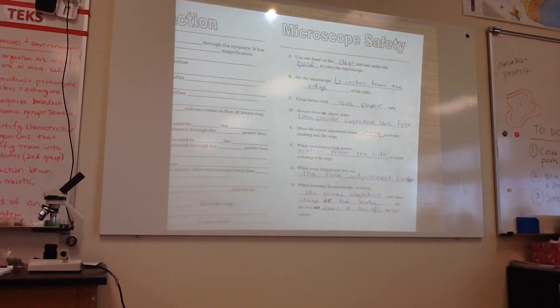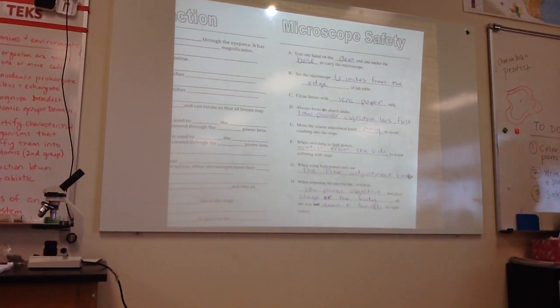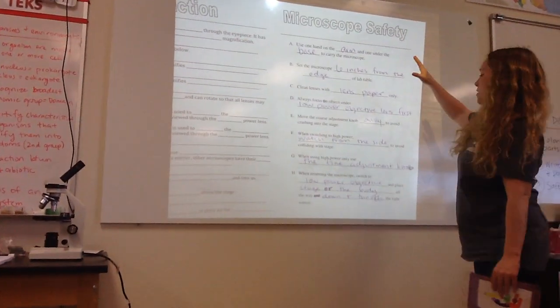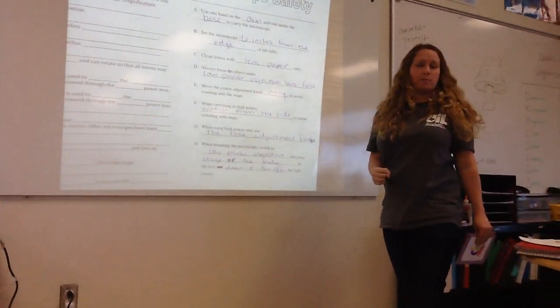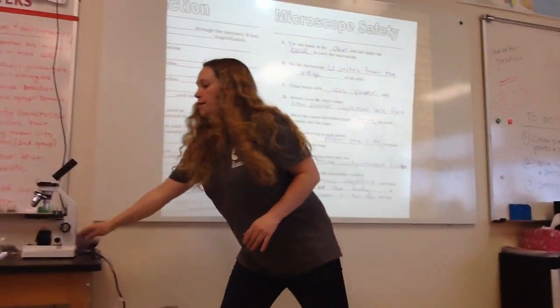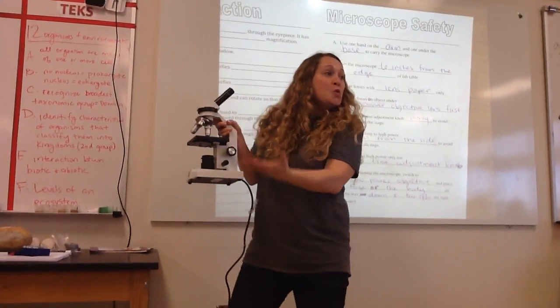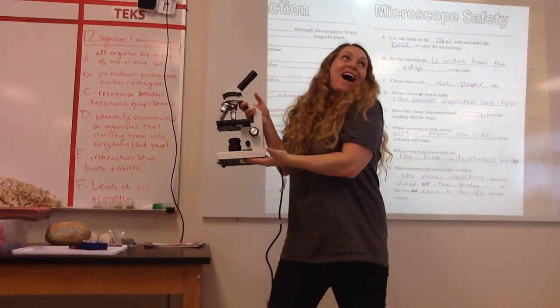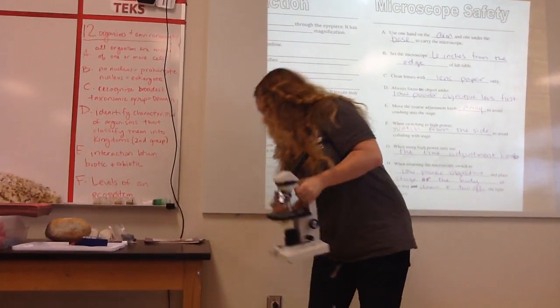All right, so students, you can fill out your microscope safety information as we go. The answers are up here, and I'll be going over them and showing you how to use the microscope. So, this is a microscope. Okay, so it has a plug.